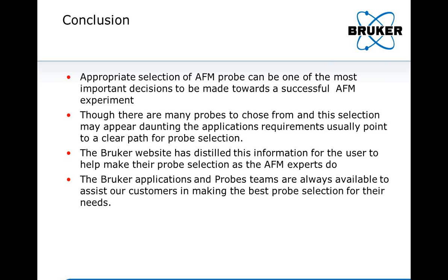And they have a Dimension Icon. I guess I would need to know a bit more to really troubleshoot it properly. But provided the adhesion is not too much, use a larger modulation amplitude and maybe a lower modulation frequency. Start with a stiffer probe to get a feel for the app, and then slowly move down in spring constant to understand the limitations of your system.